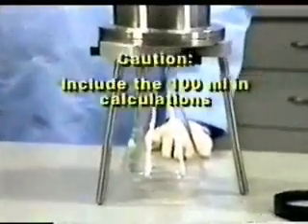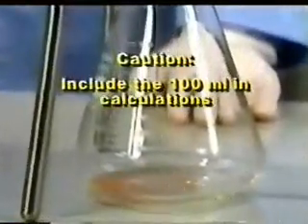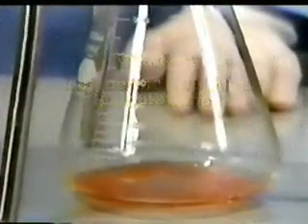The viewer is cautioned to include the 100 milliliters of extraction fluid used to store the filter when calculating method 1311 final analyte concentrations. We have several interesting conclusions and quite a bit of very useful information generated from this project.